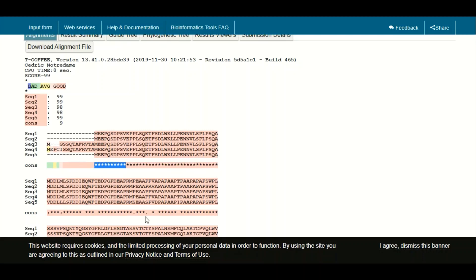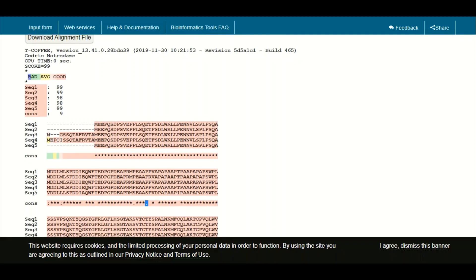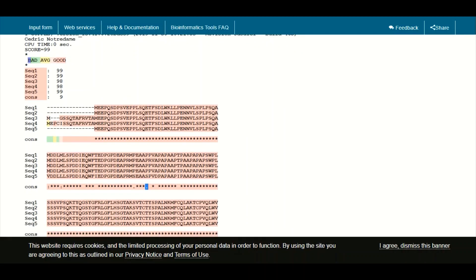You can also see asterisk signs and dot signs here. The asterisk signs indicate that at that position all of the amino acids are identical, while the dot signs indicate that at that position the amino acid residues are not identical but are similar — a concept we have discussed in previous lectures and tutorials.